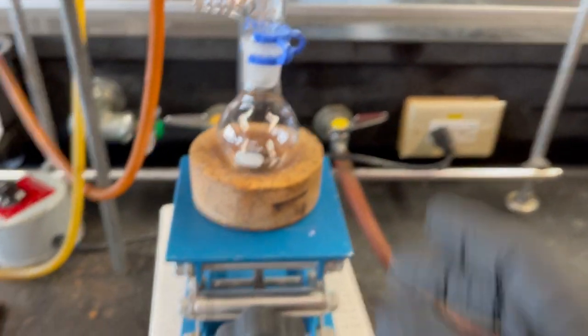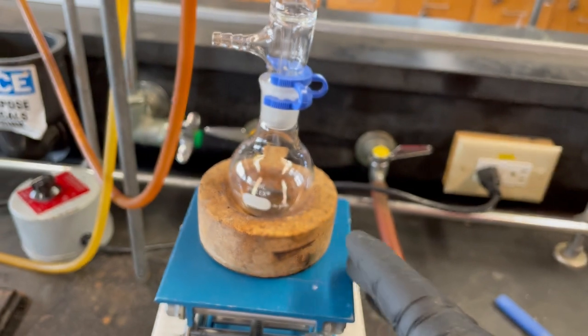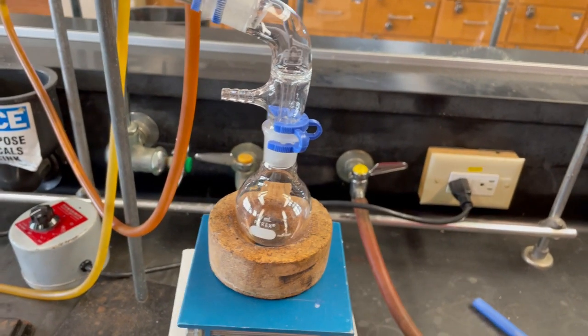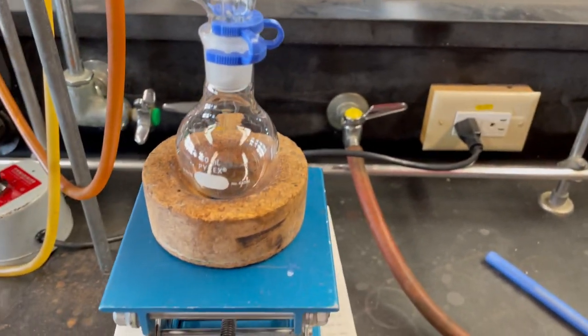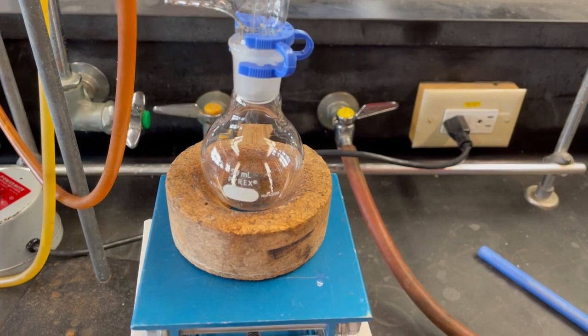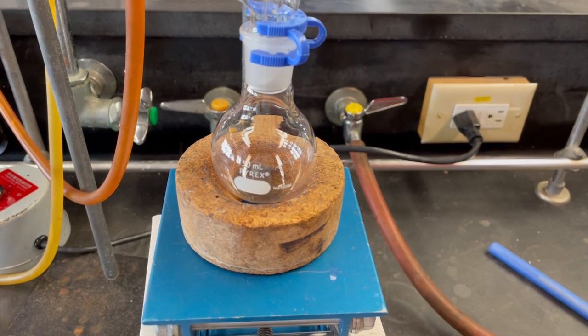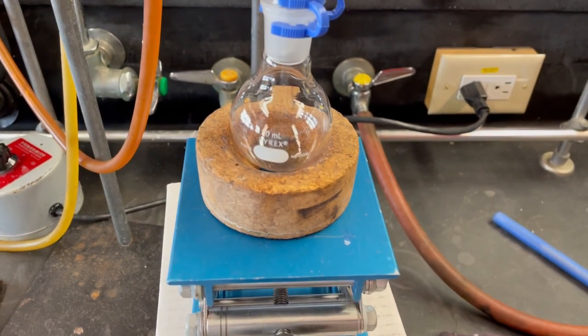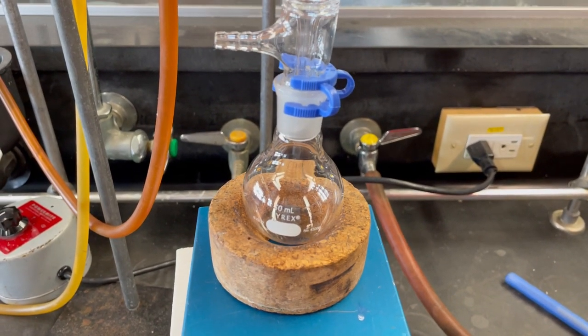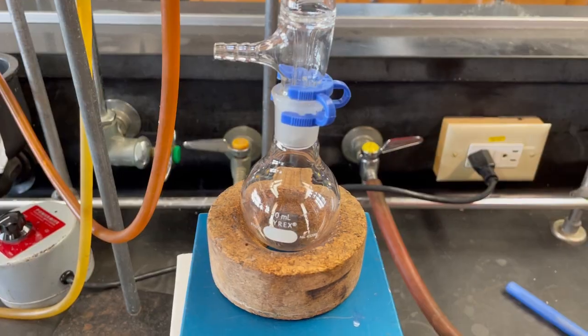So another thing I wanted to mention is that I could technically have this sitting in an ice bath to have it cool, and that will create a pressure differential that will make the process move at a decent pace. But I'm not going to use ice. I'm just going to let the distillation go as it may. And so yeah, let's go ahead and get that started.